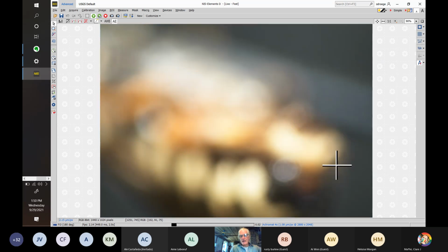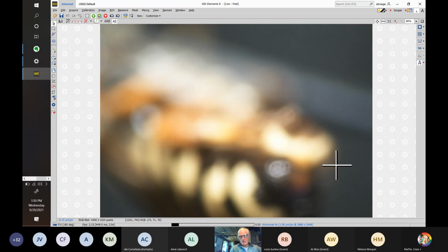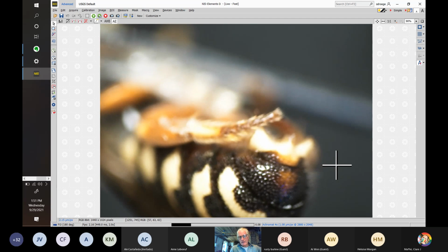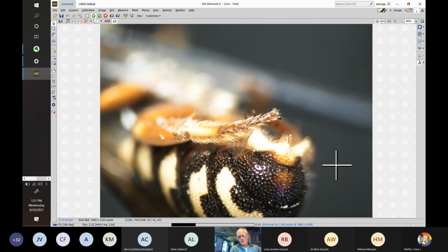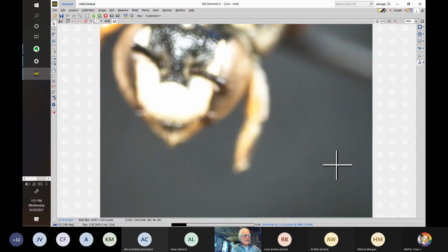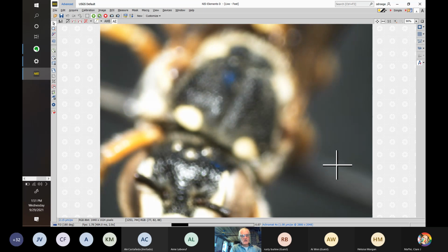Yeah, it very much has wings and plates and projecting sections. I don't know if any of that reaches the level. There we go. You know, spine in the middle, two wings on the side, lots of different variations on that for the different species. Otherwise, male-wise, we go to the front of the head. Let's go from this direction. We should be able to see those same characters that we did last time.